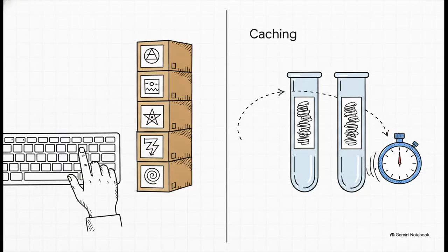Okay, let's talk about an advanced pro tip for your workflow. If you're collecting data specifically to train new predictive models, your data has to be neatly labeled. It's a must. In the device settings, under batch naming, choose manual keyboard entry, so you can give each batch a unique name. Plus, be sure to turn on cache last name. This automatically fills the name prompt with whatever you typed last.